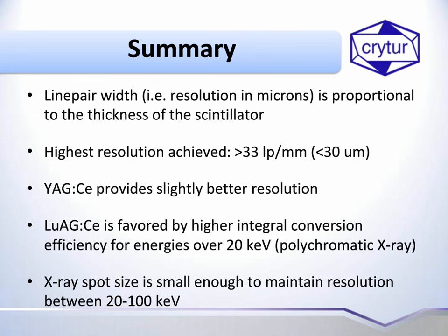Okay, thank you. Can scintillators be coupled to systems that operate at temperatures above 80 degrees Celsius? 80 degrees Celsius? Mm-hmm. Well, our scintillators, garnets, are very stable with the temperature, so 80 degrees would not be a problem. The melting point would be somewhere around 2,000 degrees, so 80 degrees will work with the scintillator. Okay, thanks. Do you have scintillators for detecting thermal neutrons?